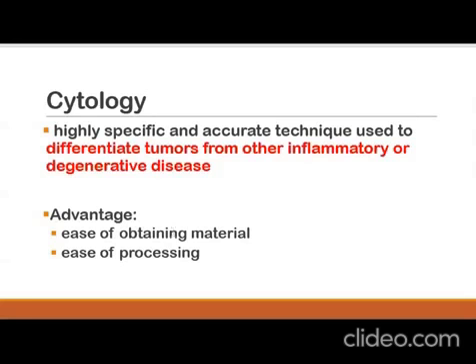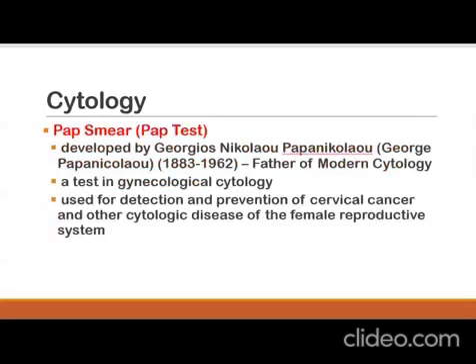Okay? So, I have already mentioned that your Pap staining method is the well-known and the most commonly used technique under cytology. So, let us now discuss that one. So, your Pap smear is again a test in gynecological cytology. It is used for detection and prevention of cervical cancer.